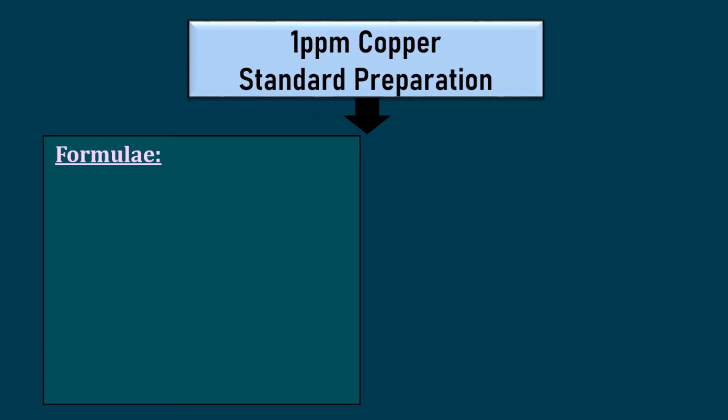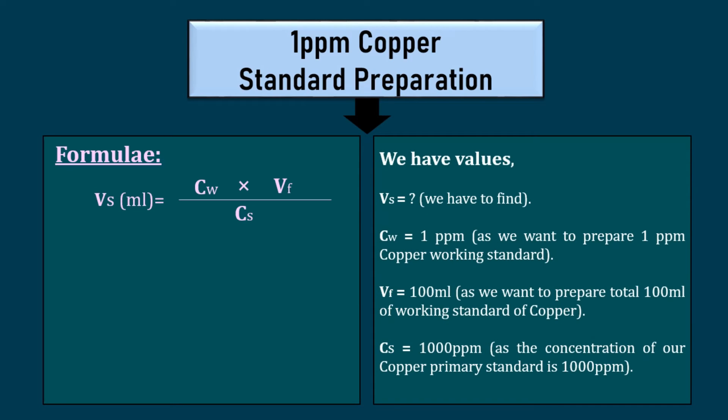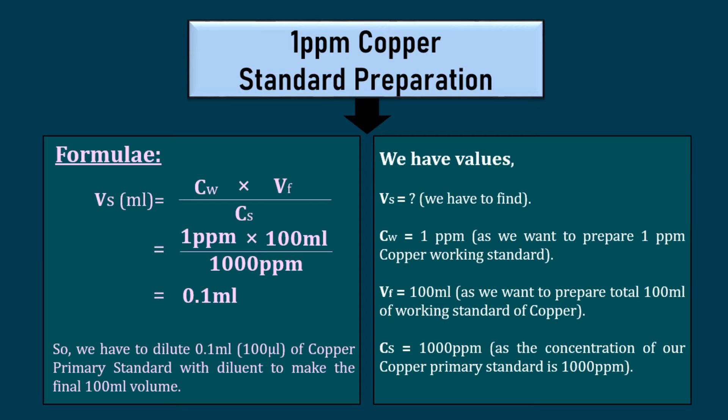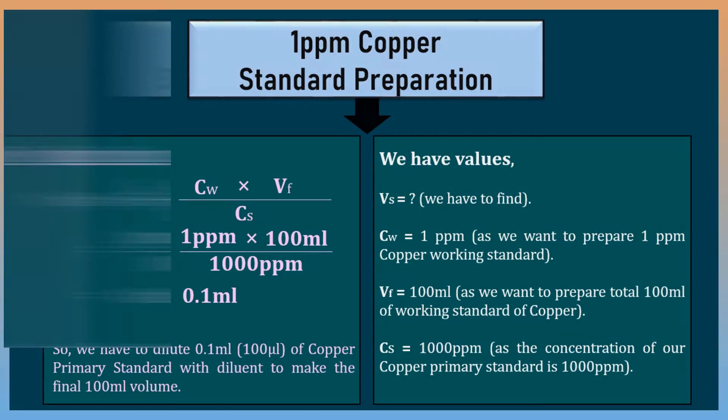Now, we will calculate the amount of copper primary standard needed to prepare 100 ml of copper working standard. By calculating, we found that we need 0.1 ml or 100 µL of copper primary standard to transfer. Let's do it practically.